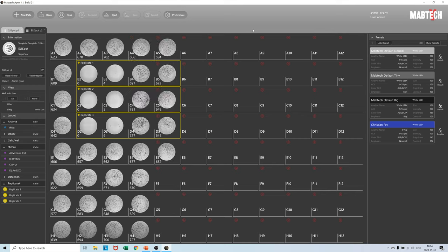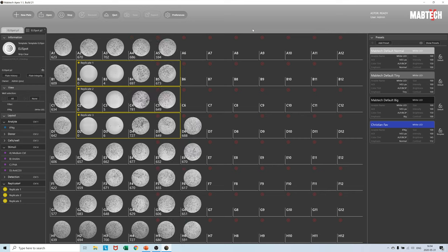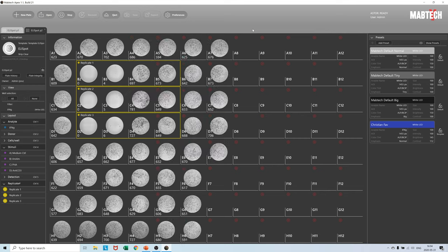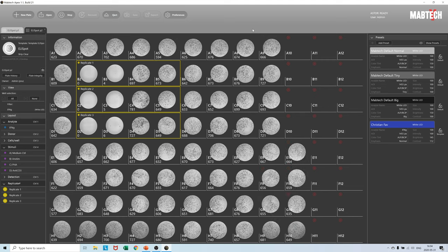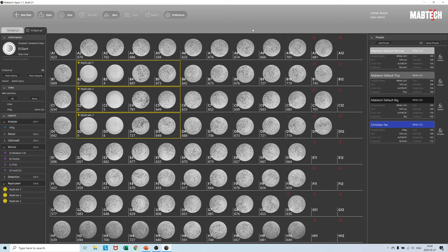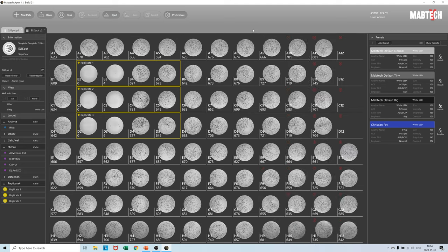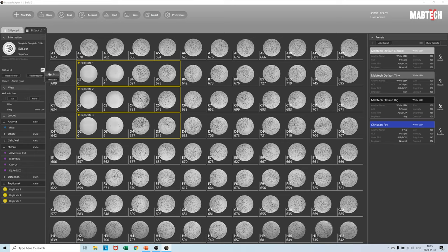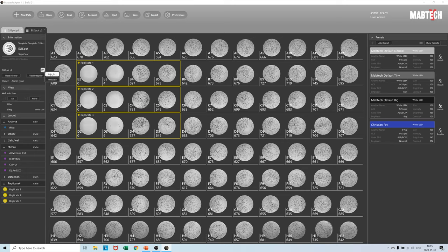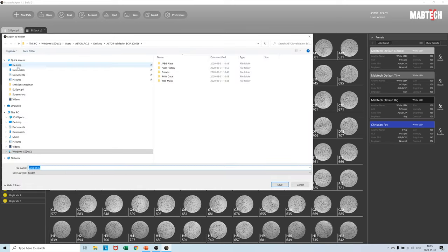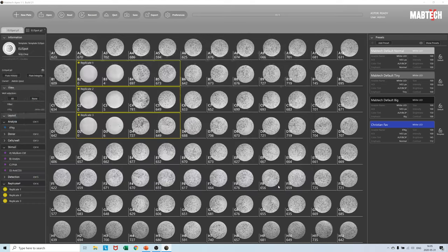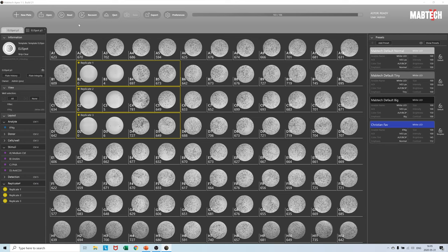Once the new plate has been read we must make sure to use the save as button found up here under the information section. Just like with Microsoft Office software the old files are still intact in Elispot P2 as long as you have used save as. The new plate, the third one, we save as Elispot P3 on the desktop.